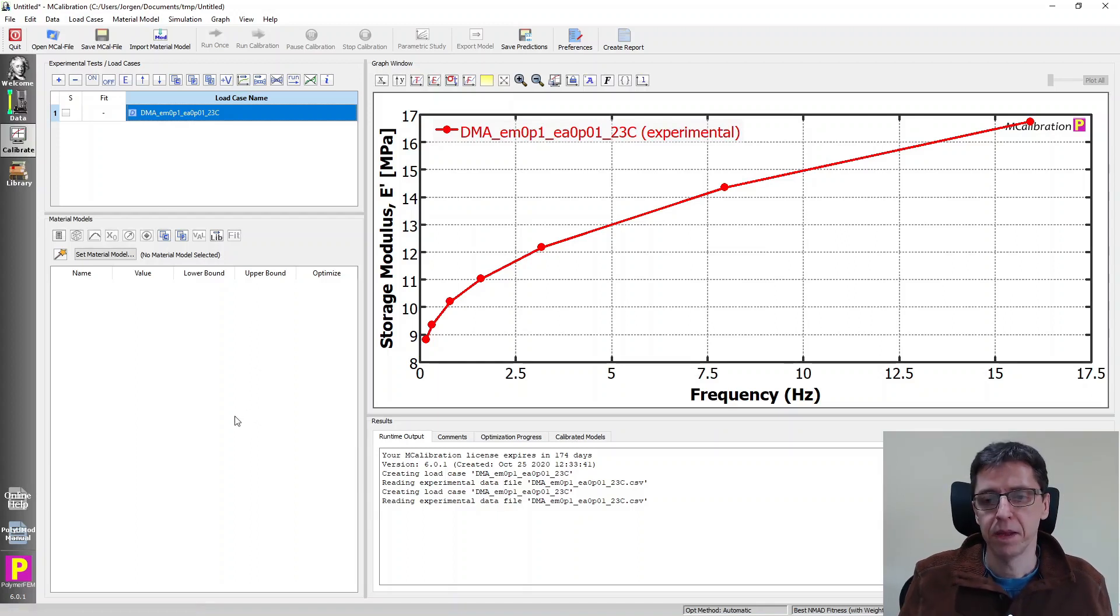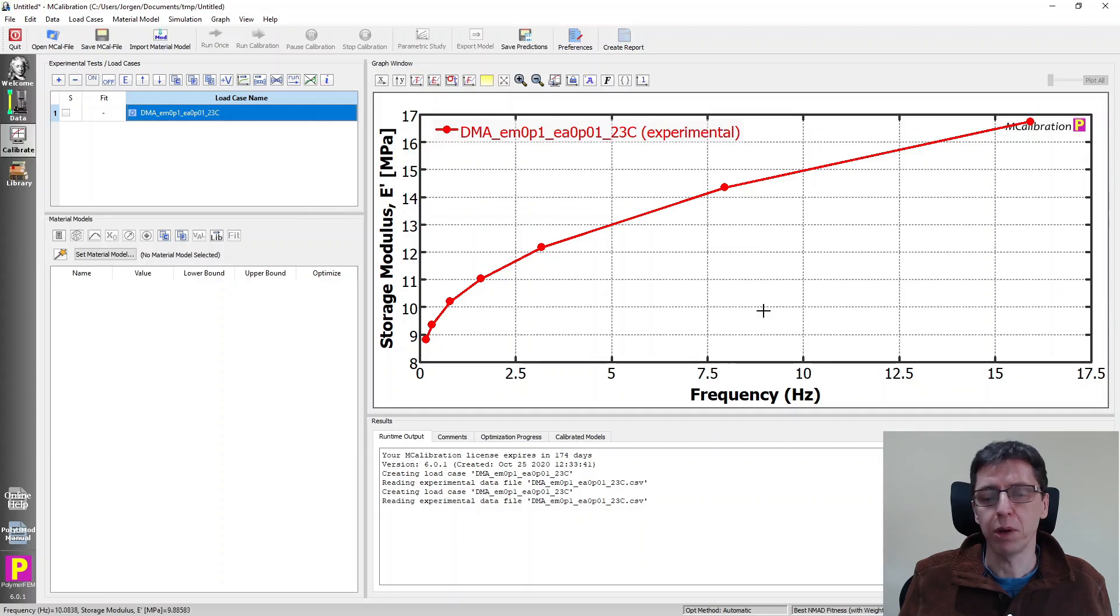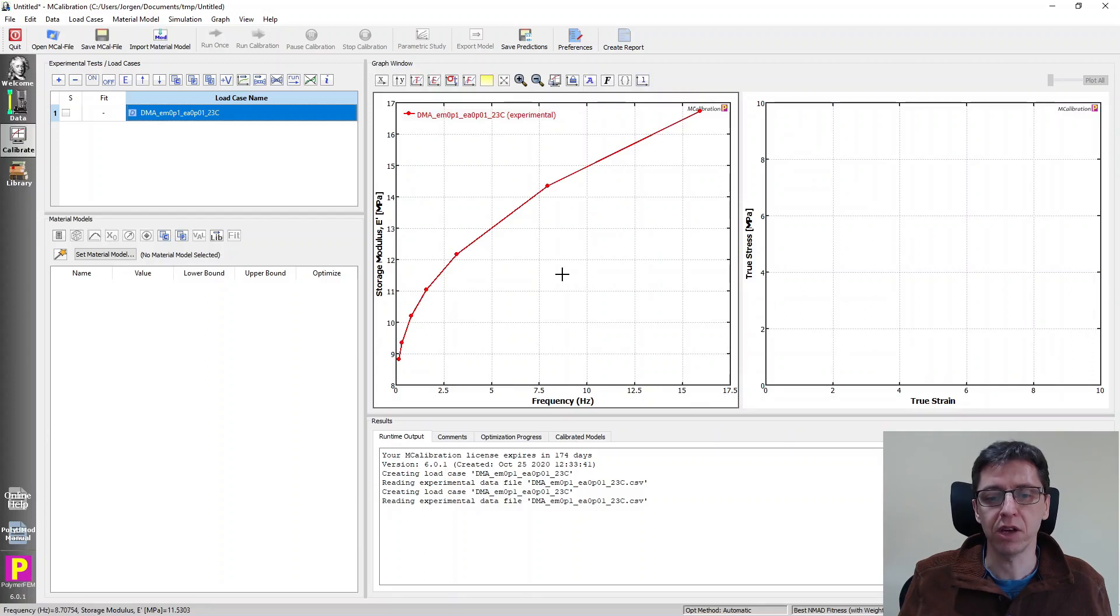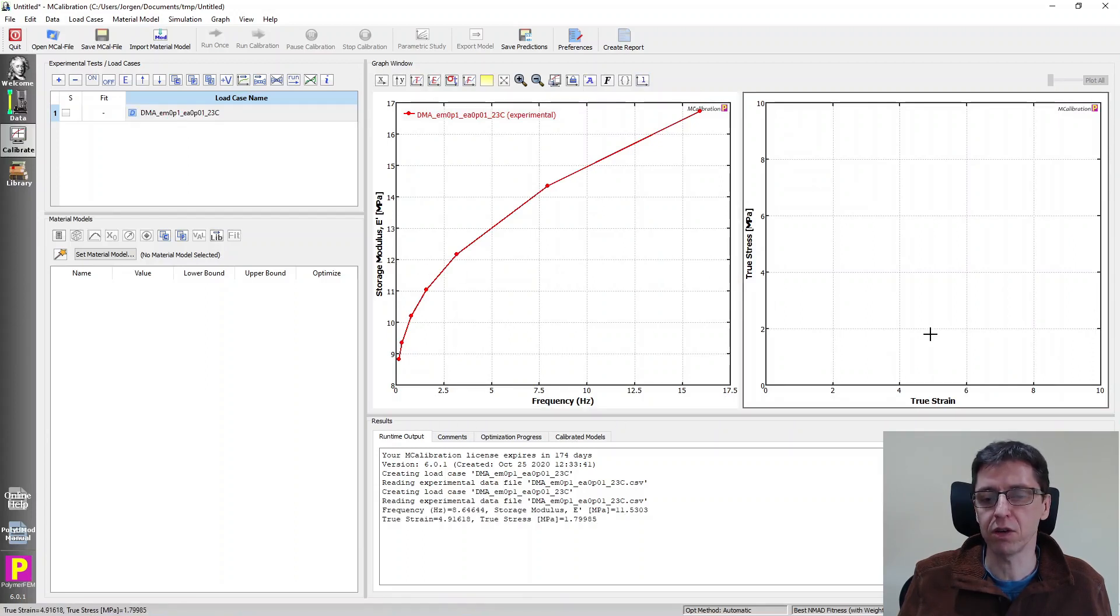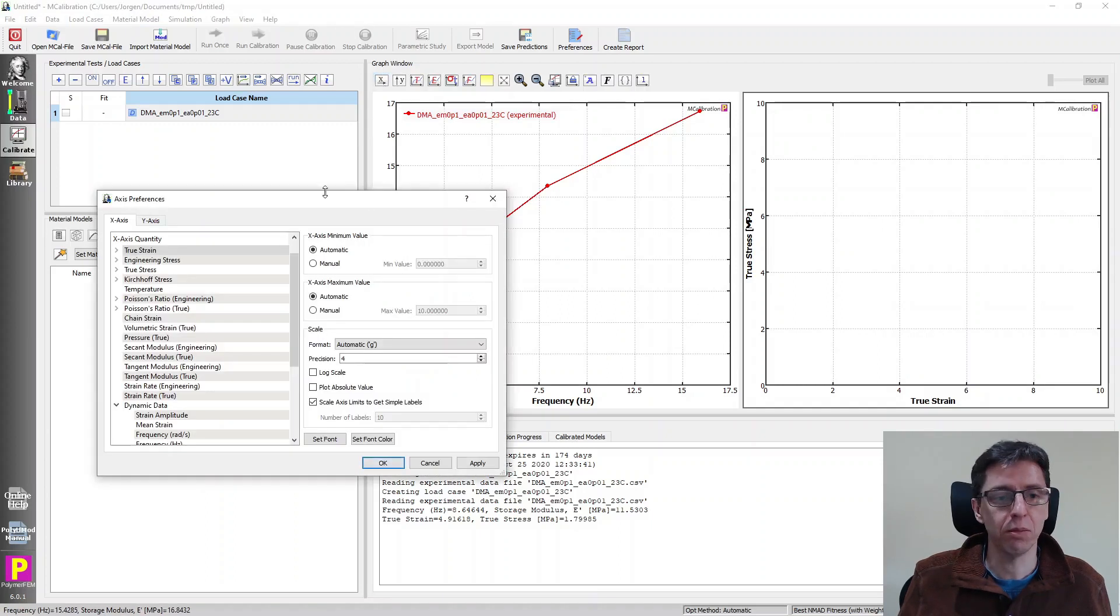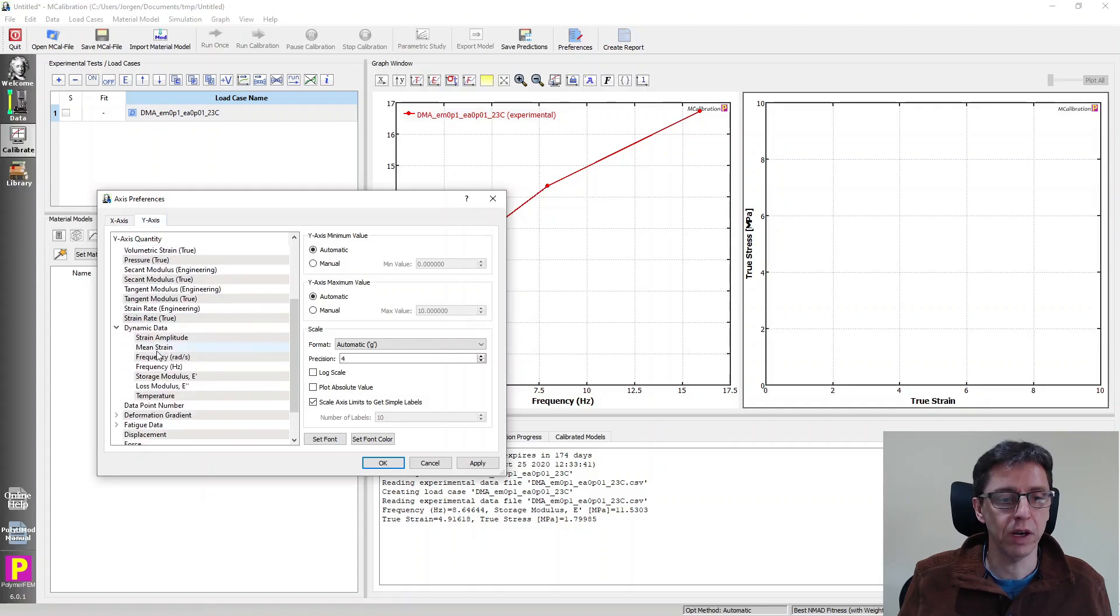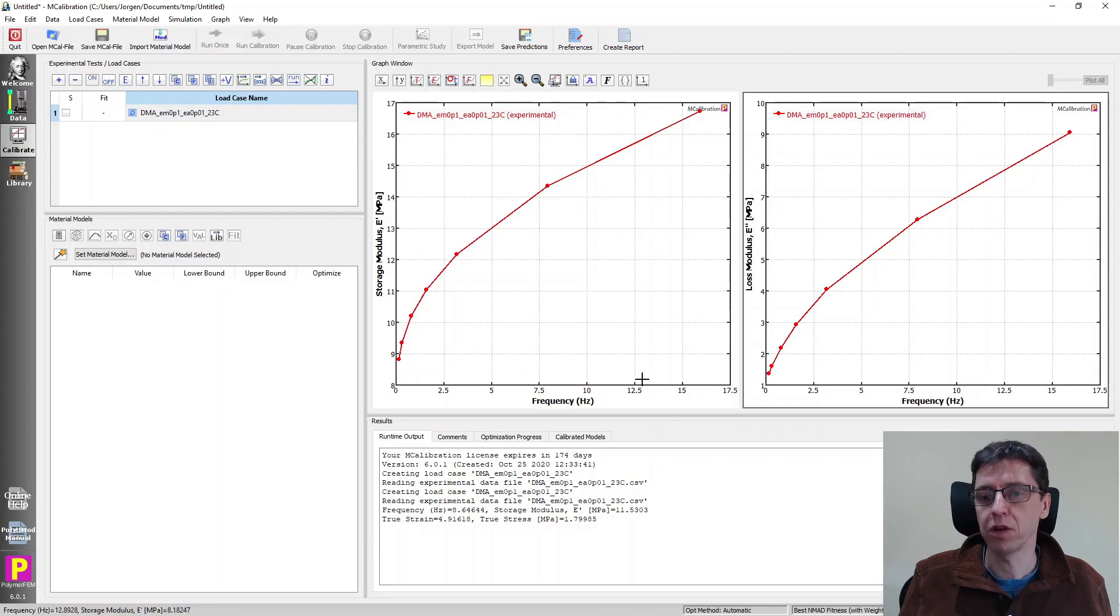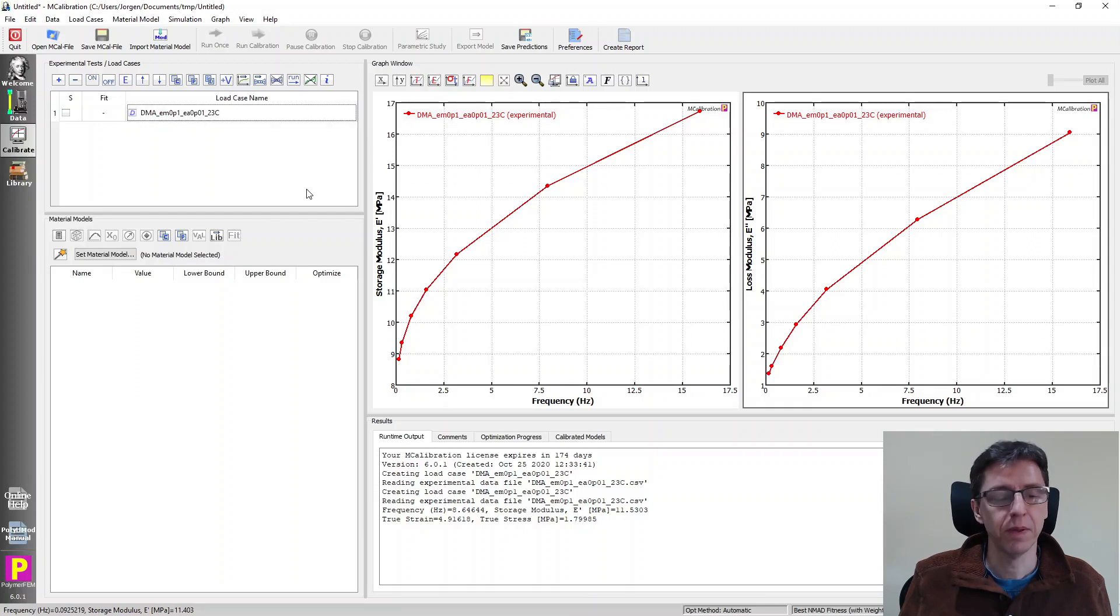Here's our data. And that's kind of interesting. What I want to do is we want to plot all the data. There is a feature here that can allow us to plot two graphs side by side. So now on the left side, we have storage modulus versus frequency. If I click on the right side to select it, I can change the quantities to be plotted here. I'm going to plot on the x-axis, frequency in hertz, y-axis, loss modulus. So here's the loss modulus data. And on the left is the storage modulus data. So that looks pretty good.